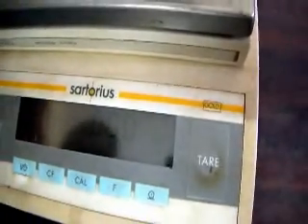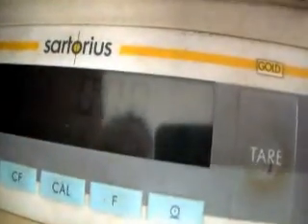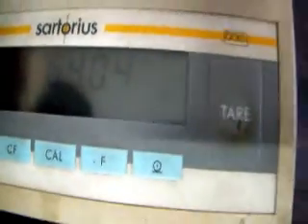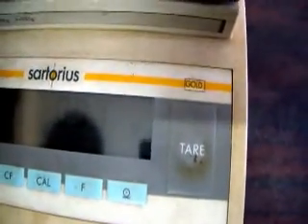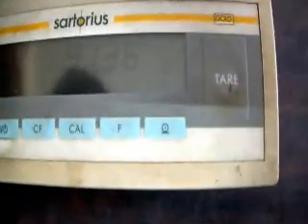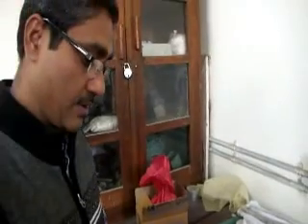Now come to the 45 centimeter, let me put it here, this is 00 gram. So dry soil plus box is 64.04. And the box plus dry soil of 60 centimeter depth, let me check, it is 91.36 gram. So let us remove the soil and find out the weight of empty sample boxes.